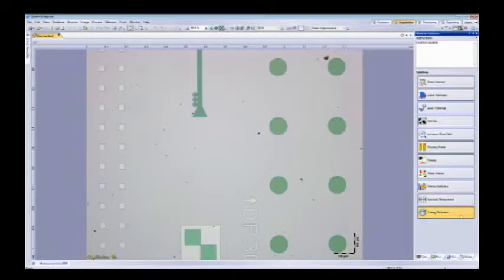Can you show us a couple of those? Yeah, two of the new ones that we added to Stream 1.9 are automatic measurement and coating thickness. Automatic measurement is just that. The software can actually take a motorized stage and drive around and take automatic measurements of patterns. These patterns can be repeatable in different areas. There might be something where the customer is looking at a pattern and they want to take it off, process, like polish or do something else to the sample, put it back on and move right back to that.